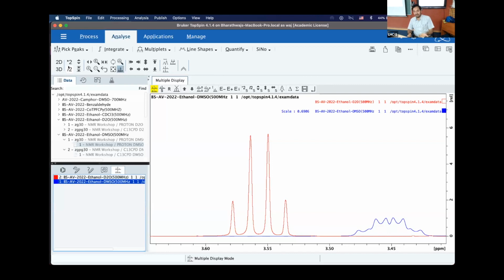We saw that in an AMX system. Did you see that? Yeah. So the same thing is happening here. Two things are happening. In addition to R2 changes, you're also able to see that the coupling is the major change. A 50% change happens due to coupling. Make sense? Good question. Good.